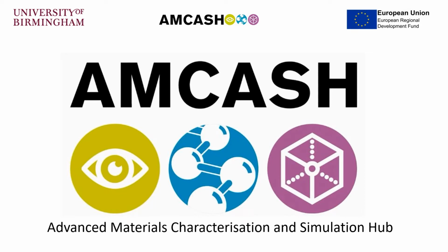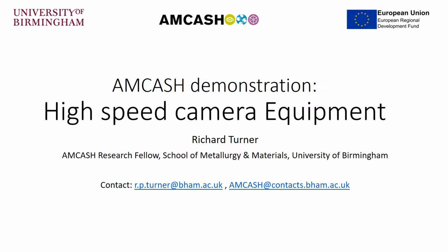AMCASH, Advanced Materials Characterization Simulation. As a part of the AMCASH demonstration series, this talk is about the high-speed camera that the University of Birmingham owns as part of the AMCASH project. I am Richard Turner. I'm a research fellow at the School of Metallurgy and Materials at the University of Birmingham.